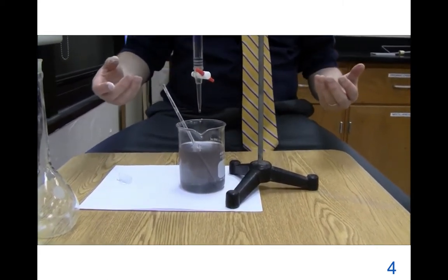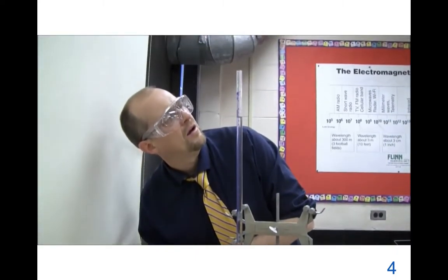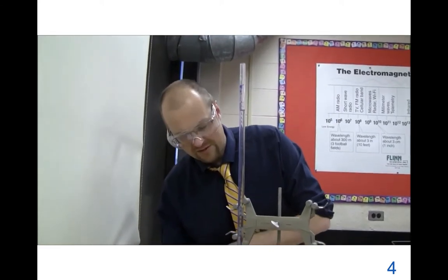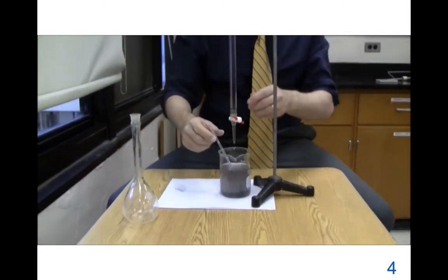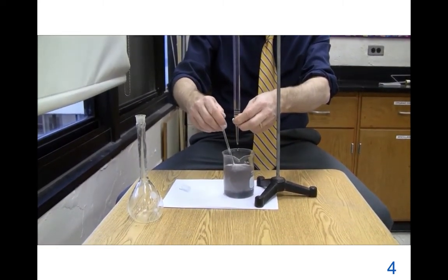Now that might be the end, I can't tell, so I'm going to take a reading. It's exactly 1.95 milliliters. So I'm not sure if that's the end. So I'm going to remember 1.95 milliliters. Oh, you probably should write it down if you're doing the experiment. Now let's carry on and see if this is indeed the end.